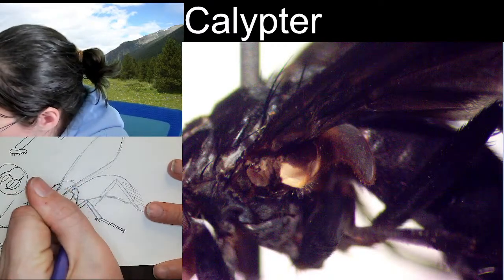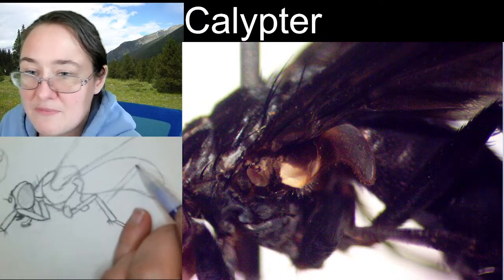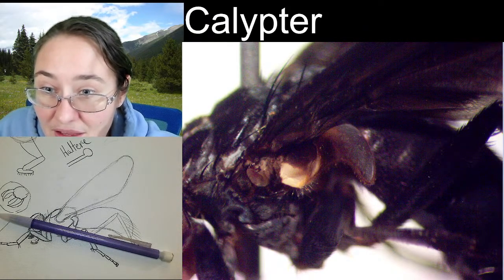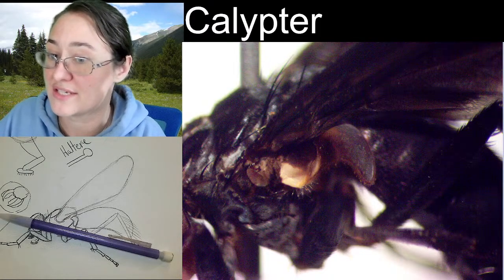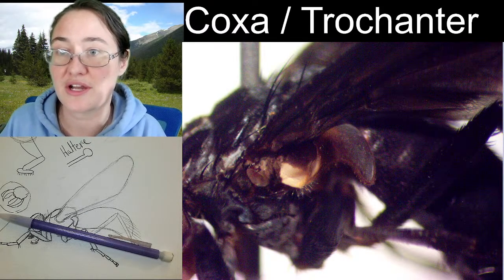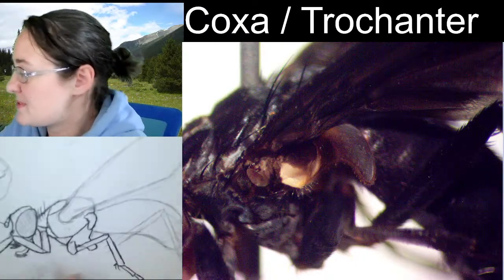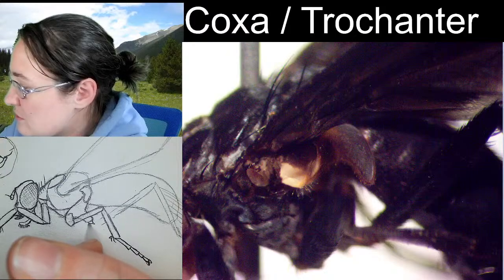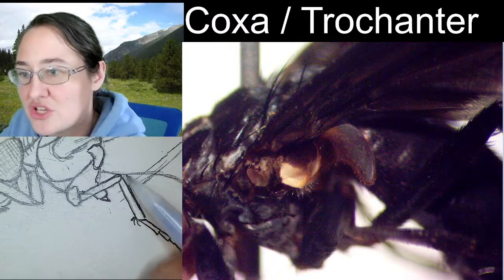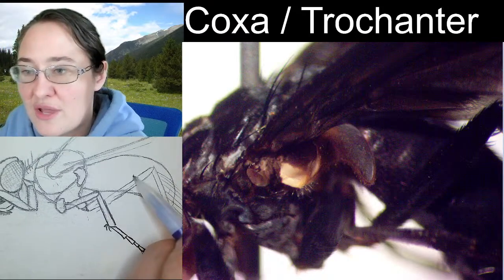Angle it this way just a little bit. And then I'm going to be getting my femur and taking it up from here. From this view, we actually can see the trochanter just a little bit. So we don't get to see the trochanter regularly. You get the coxa, and then the trochanter exists in between the coxa and the femur. Tends to be just like an itty-bitty pizza-shaped segment, or little triangular-shaped, like this. Kind of like a little triangular segment here, but that's essentially the knee. It helps it bend, and so then when you connect the femur, you connect it to the trochanter, going in the direction the trochanter is.